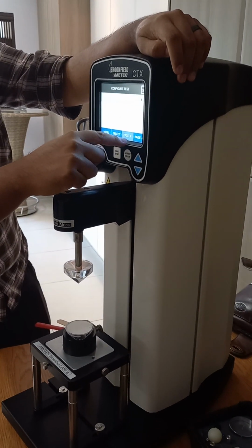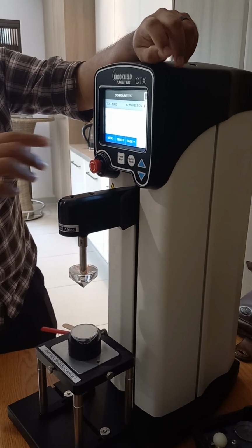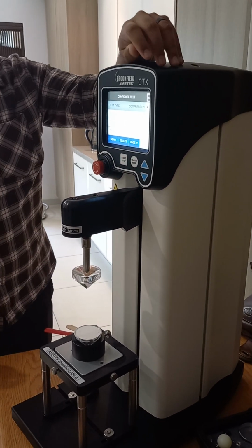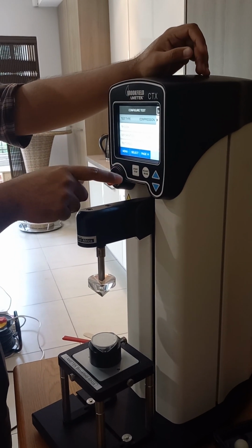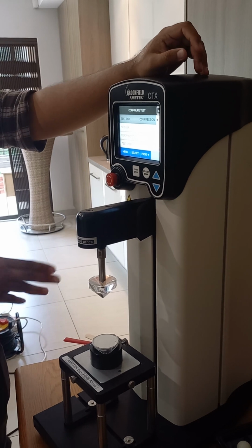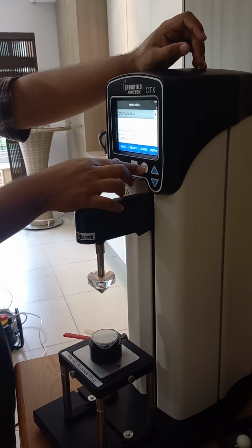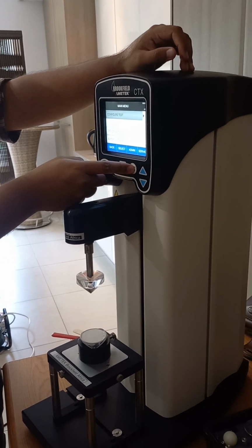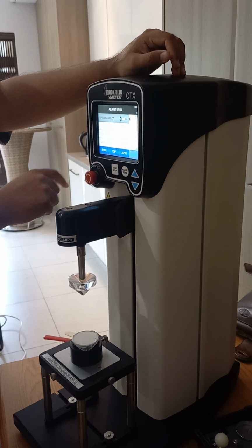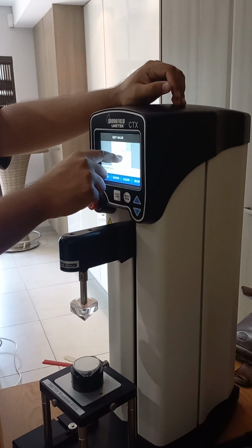Okay. So that's your basic parameters. Done. Set. Next, so we make the test a lot quicker, I'm just going to go back to the menu, adjust the beam. So we'll just set a top limit. Make that 60.